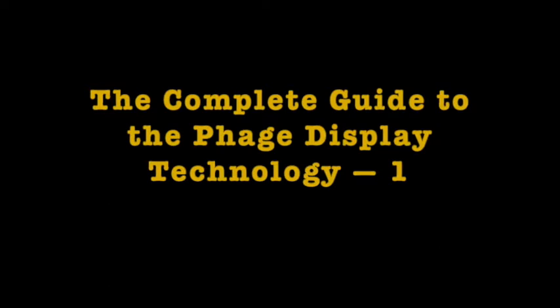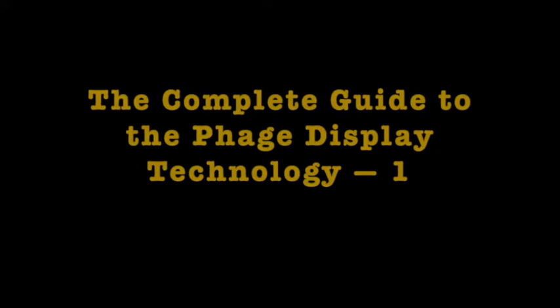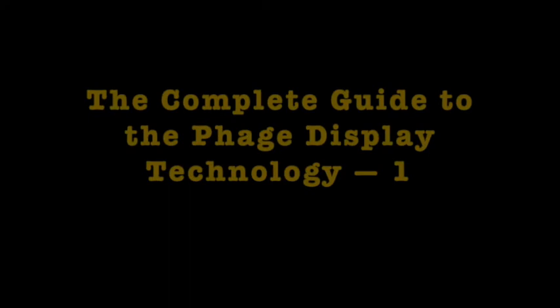In general, the preparation and screening of phages expressing specific proteins or polypeptides can be conducted according to the following steps. 1. Prepare a large number of display libraries of phage clones with a specific protein or polypeptide displayed on the surface of each phage. 2. Display libraries are used as mobile phases and target polypeptides or protein molecules as stationary phases to make the two phases contact and interact with each other. 3. Phages that cannot specifically bind to target molecule are abandoned. 4. The collected bacteriophages are used for further amplification of E. coli infection, resulting in an enrichment pool as a display library for a new round of elution.